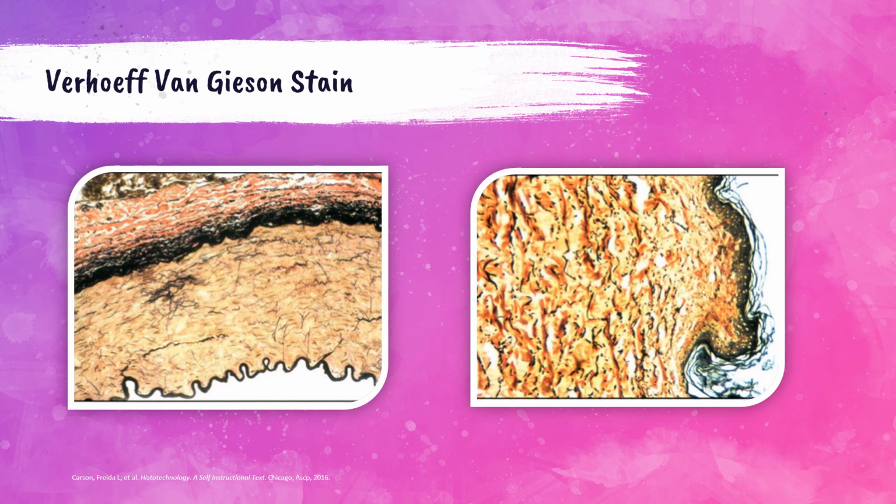The photo on the left-hand side of the slide shows a muscular artery cross-section that is stained with the Verhoeff Van Gieson stain. The black color here are the very fine elastic fibers. The yellow is the muscular tunic media, which is the middle layer of the blood vessel, and the collagen fibers are stained in this red color.